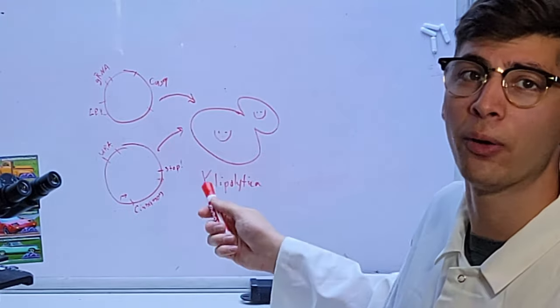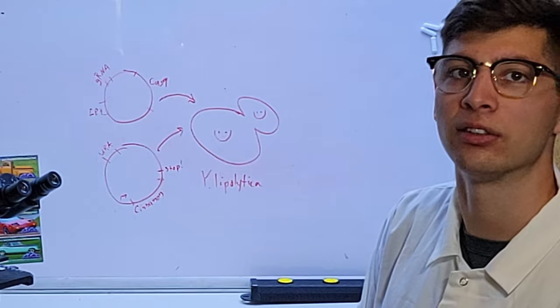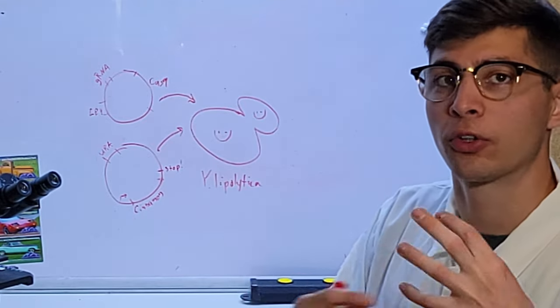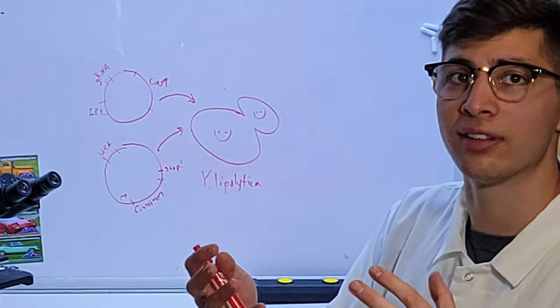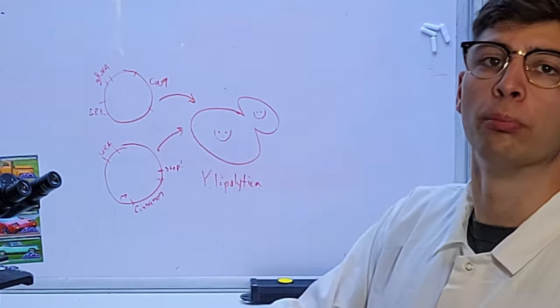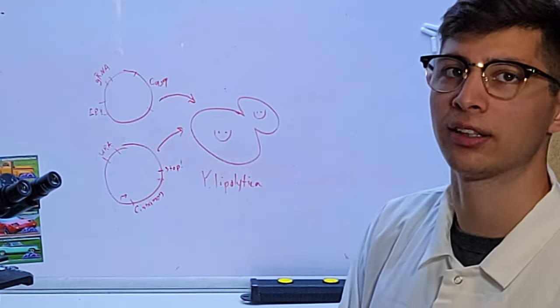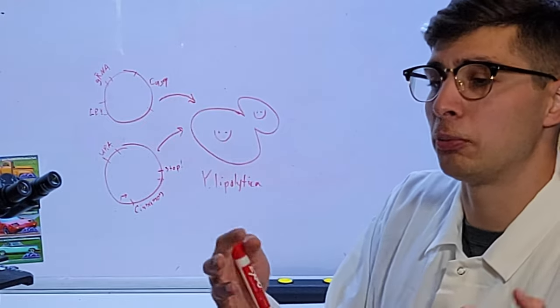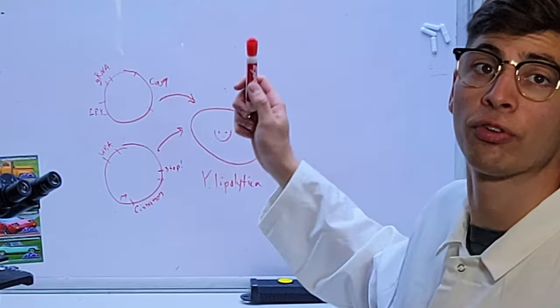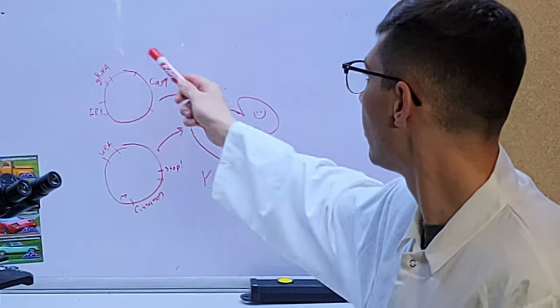As a small side note, Yarrowia doesn't have to keep these plasmids forever to express these genes. It only needs to keep them for a moment so that the CRISPR-Cas9 system can do its thing — make the cut, integrate the gene — and then we can cure or remove the plasmids from Yarrowia by growing it in non-selective media. And then it will just be the normal yeast again, just containing the cinnamon gene. And in order to do this, we need to build these plasmids.